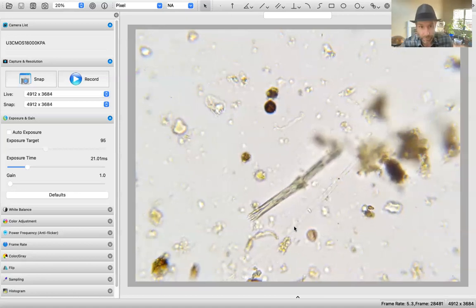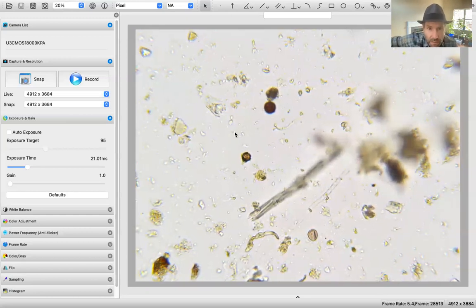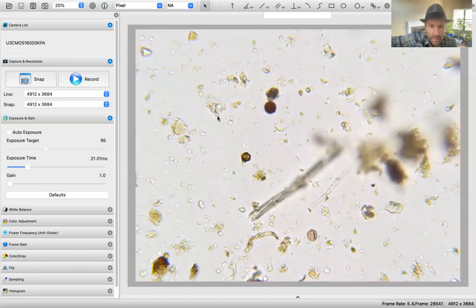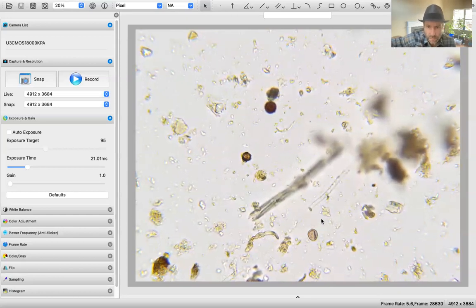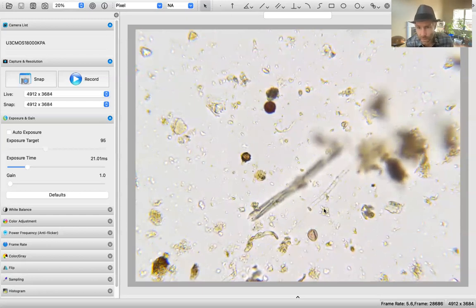4 micrometers in diameter. And that is a fungi, and it is clear, and I don't believe it's oomycetes because that is very uniform and there are no vesicles visible. So we're going to move up. Let me double check here because that might be a testate, but it doesn't look like a testate form. So we're going to call that organic matter, and we don't count mycorrhizal spores like the discs right there. This looks like maybe a dormant form of an organism, but again, no opening, so we're not going to call it a testate, and I don't see flagellates running around here.